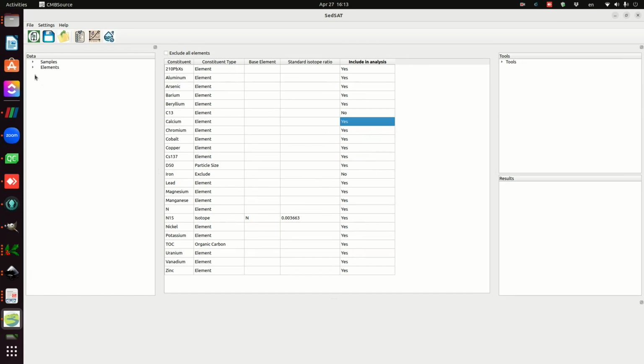So okay, the other thing you can do is inspect your results to see if it is what you want. We have this tree data structure that we can look at our data.